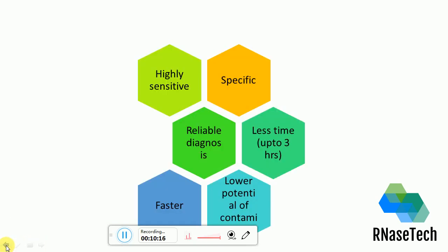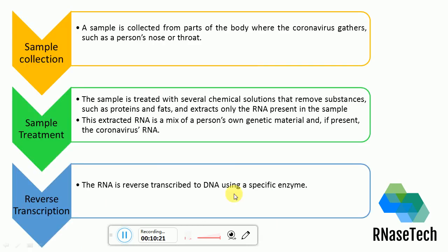Now a general question arises: from here we have multiple copies of DNA of the virus. So how do we know? We only got the multiple copies of DNA, right? How do we confirm that we have got multiple copies of DNA? For that, there is an electrophoresis gel unit, or electrophoresis process, on which we run the DNA molecule.